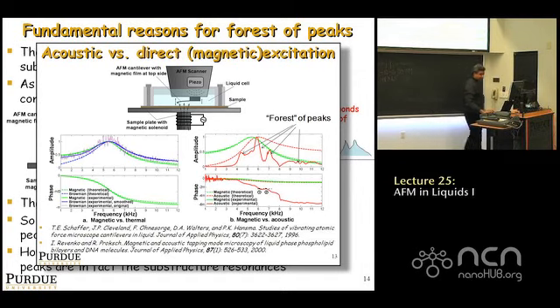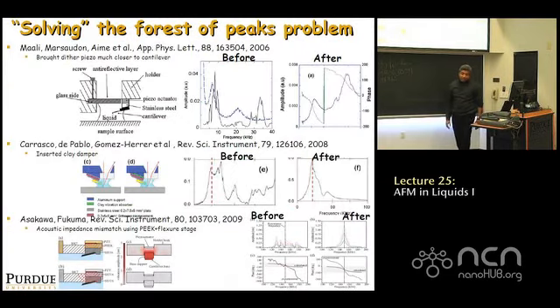And so when you choose one of these peaks, you have to keep in mind that what you're capturing in that peak is not the resonance of the cantilever, it's the resonance of something else that's shaking. Okay? It may or may not be important, it depends, right? But there are a lot of applications for which this does become important, especially if you do frequency modulation, where you try to change the frequency, and so on. So there are many methods to try and reduce this forest of peaks.